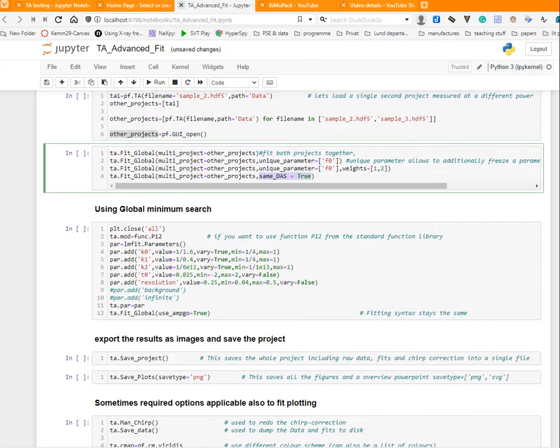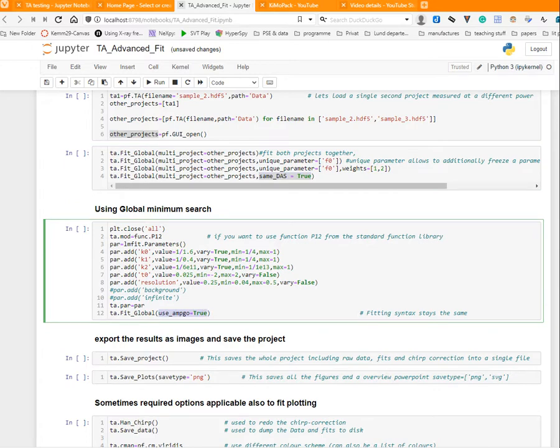There is a global minimum search which uses AMPGO. AMPGO is a tunneling process manager which checks in the limits of the parameters and uses different starting parameters and then does an optimization. Internally, I use Nelder-Mead as a standard optimizer. If you switch to AMPGO, you use locally Nelder-Mead, but use AMPGO as an external one.